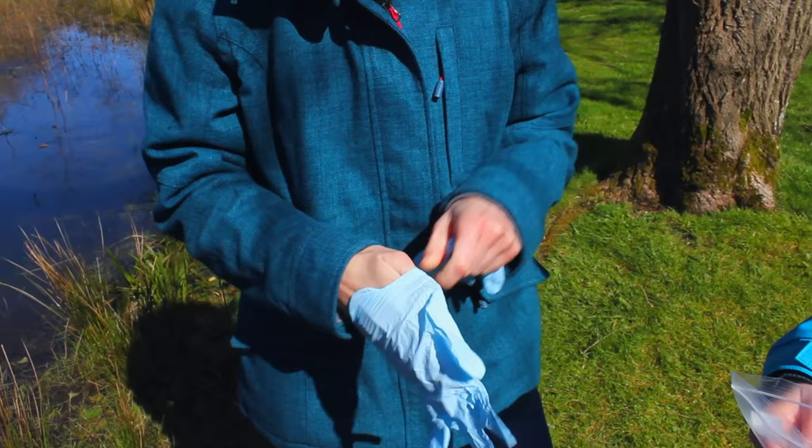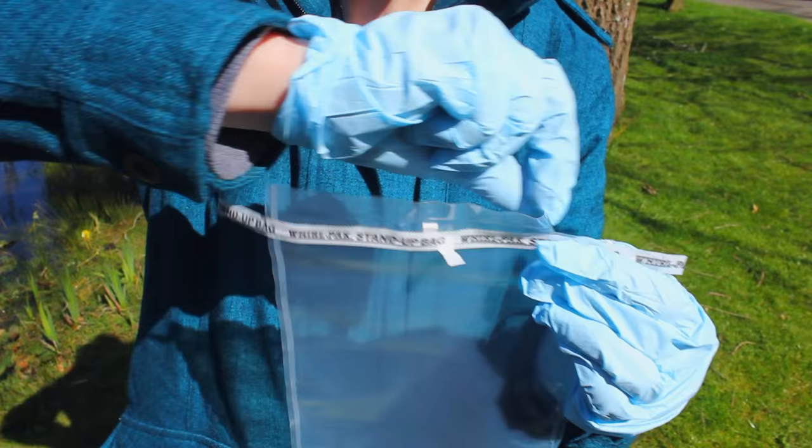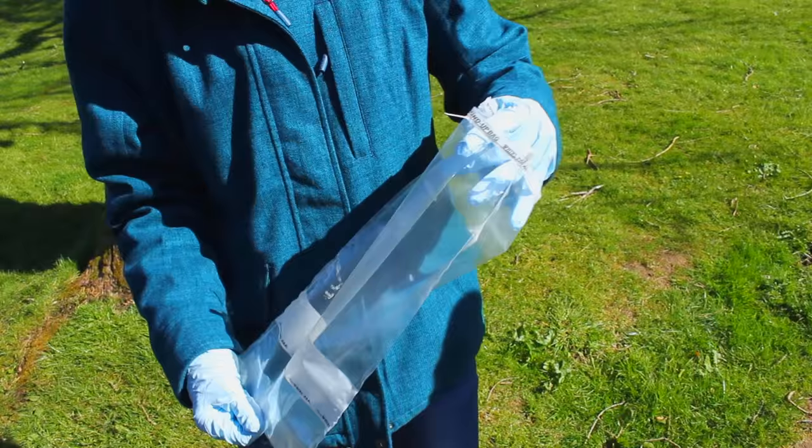I've got Hannah with me as well because it's safer to undertake the sample in pairs. Please read the health and safety advice on the website before you undertake the survey. Put on the first pair of sterile gloves, then take out the sample ladle and the Whirlpack bag. To open the Whirlpack bag, unfold it, tear off the strip along the top and pull it open using the tabs like this.